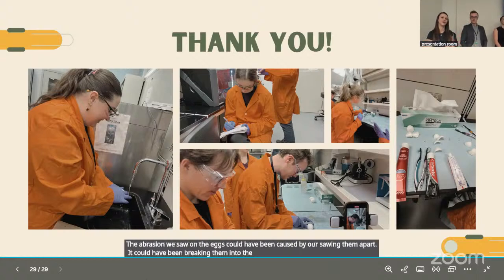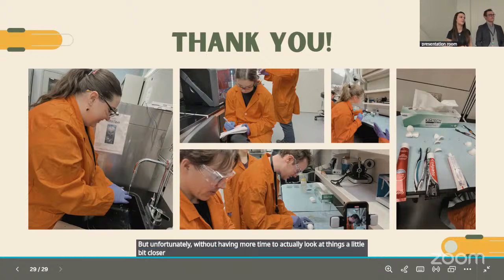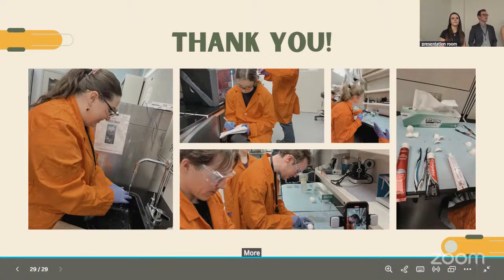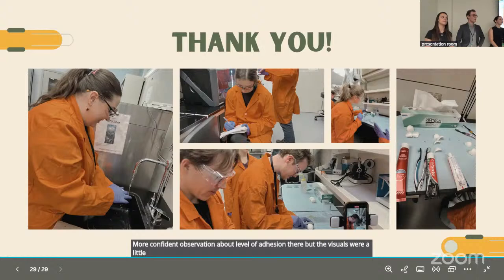It could have been the toothpaste, but unfortunately, without having more time to actually look at things a little bit closer, it was really hard to differentiate. But things like the concentration on the spectroscopy files, we are able to analyze the amount of silicon. So that gives us a more confident observation about level of adhesion there. But the visuals were a little trickier to be confident about our analysis.